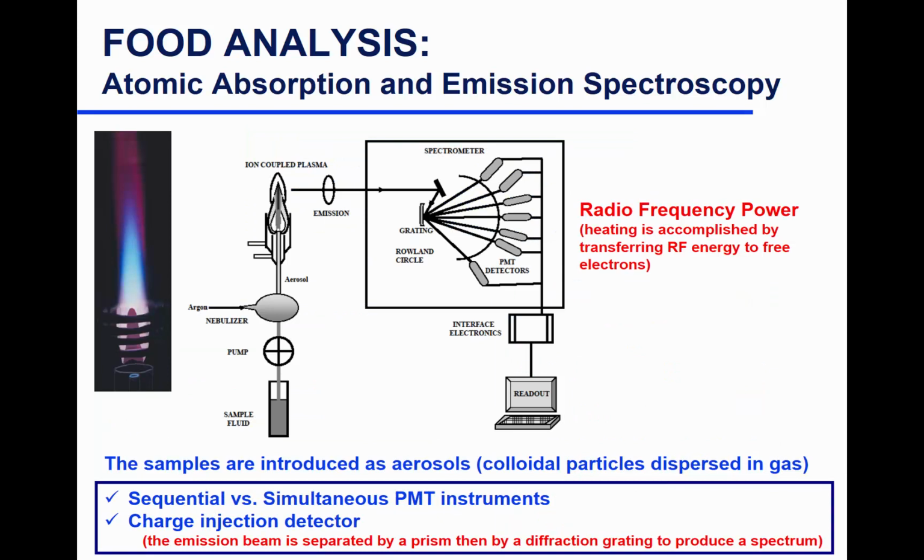So here's a breakout of the ICP. Again, you have your sample. It's pumped into a nebulizer, which is what converts the stream of your liquid into mist.